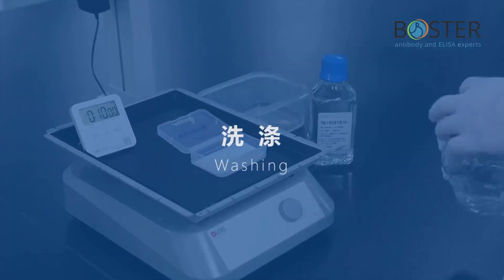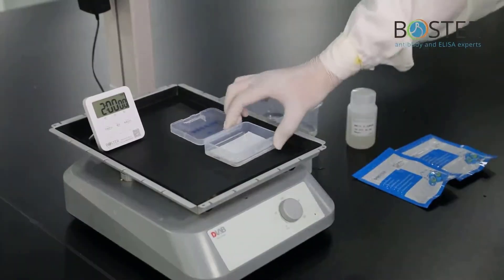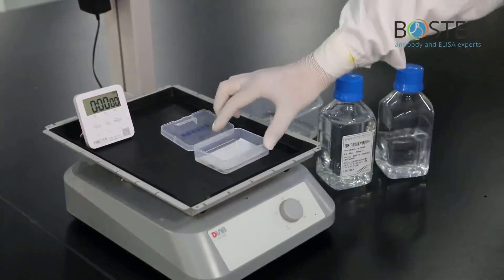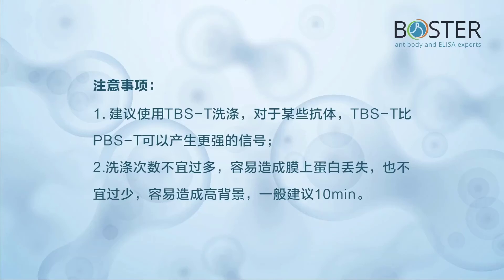Step 11: Washing. These are the products needed for washing. Discard primary antibody and wash for 10 minutes, repeat 3 times. Pour off the washing solution. Add the secondary antibody and incubate at room temperature for 120 minutes. Discard the secondary antibody and wash for 10 minutes, repeat 3 times. Precautions: it is recommended to use TBST for washing, as for some antibodies TBST can produce stronger signal than PBST. The number of washings should not be too many — otherwise there will be protein loss on the membrane — but not too few, which may cause high background. Generally, 10 minutes is recommended.